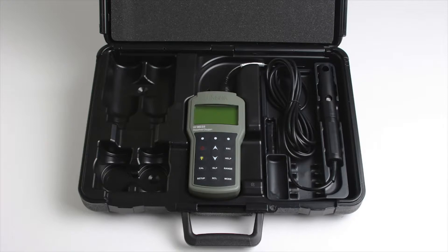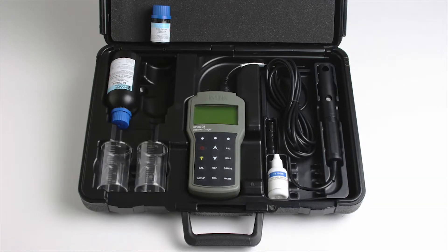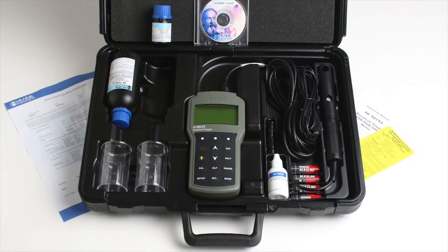Two membrane caps, two component zero oxygen solution, one bottle of electrolyte solution, two plastic beakers, four AA batteries, a micro USB cable, Windows compatible PC software, an instruction manual with quick start guide, and the instrument quality certificate.